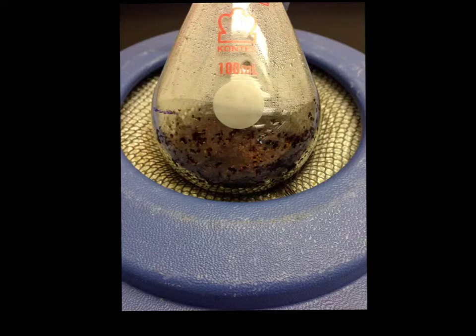Sodium carbonate was dissolved in the water used to extract the caffeine from the tea leaves. The sodium carbonate deprotonated caffeine and organic acids. This allowed for the dissolving of caffeine in the dichloromethane, but not the carboxylic salts.